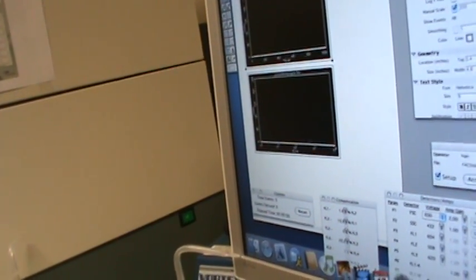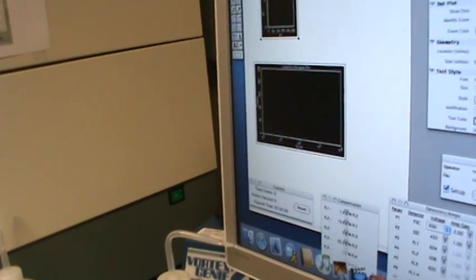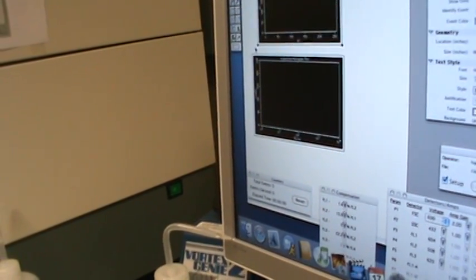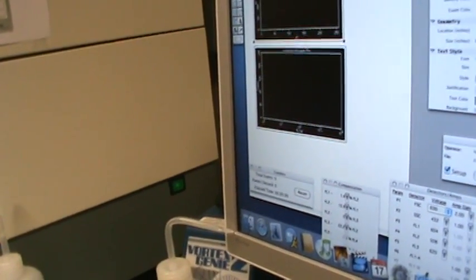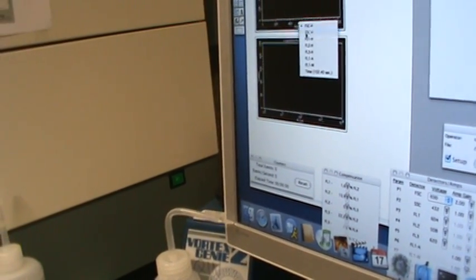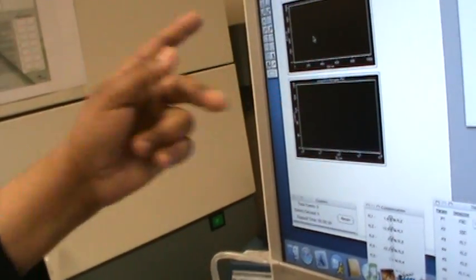I think I'm going to get rid of this one and give you a dot plot. I like dot plots because you can put your scattering. You can do forward scattering and side scattering, and that helps you figure out your compensation, your thresholds, and your voltage. So we're going to change this one to an acquisition to analysis, and here we're going to put this one to that. I always get those confused. We'll see if it's right. It might be flipped, but we'll see.